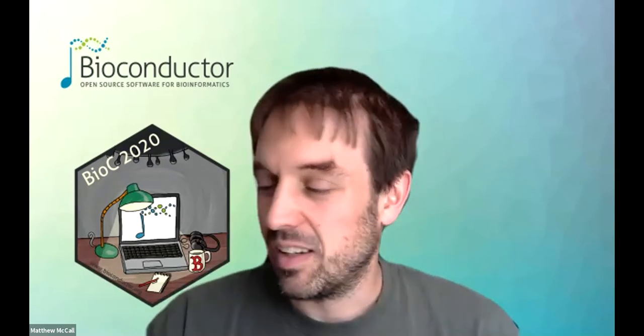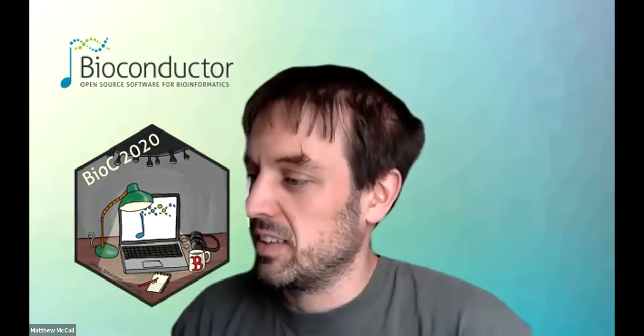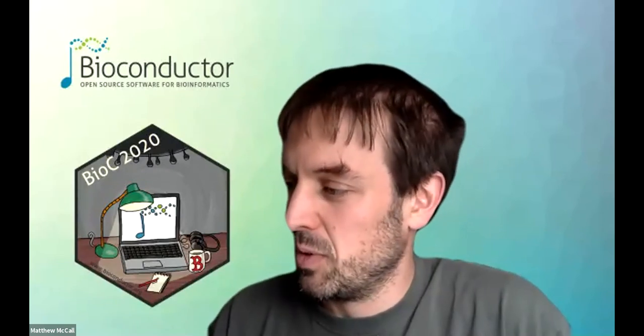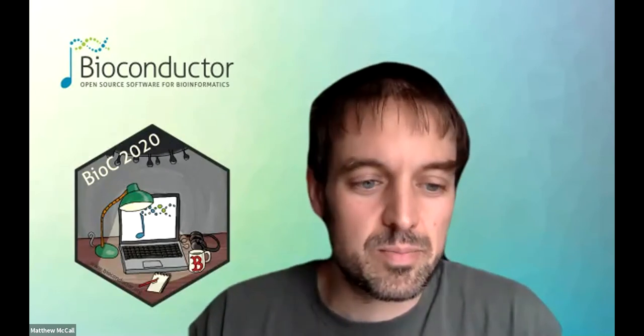No, that's great. So the next question is for Ellis. Can you give more info on the spatial statistics? Were they computed on polygons, and what distance measure was used between shapes? Okay, for everything I do, I assume that we've used technology where we've got the resolution to be able to segment cells. So if we can segment the cells, I don't use polygons.